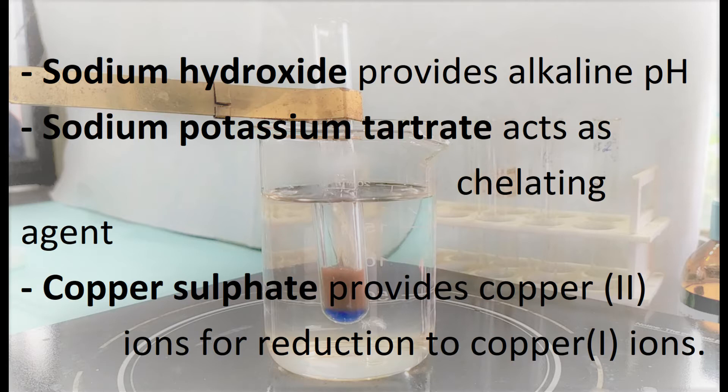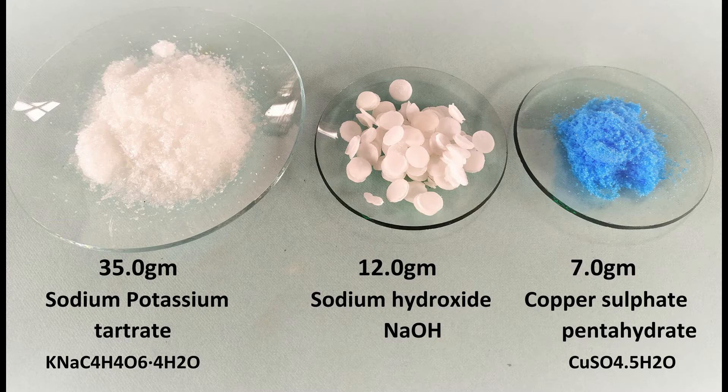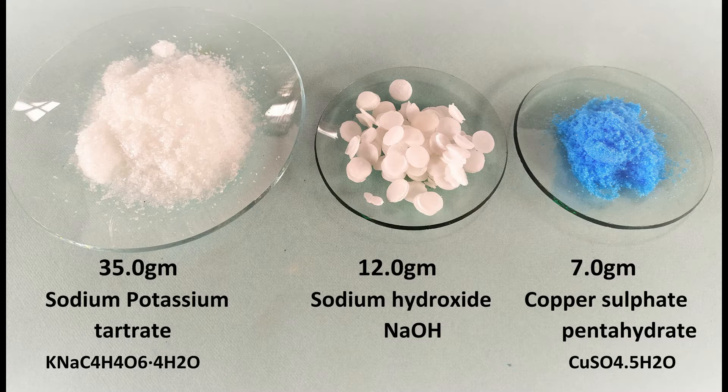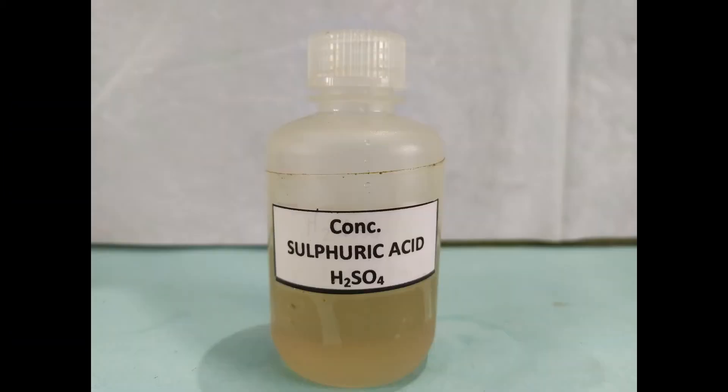To prepare Fehling's reagent, you'll need the following: 7 grams of copper sulfate pentahydrate, 35 grams of potassium-sodium tartrate, 12 grams of sodium hydroxide, distilled water, and concentrated sulfuric acid.